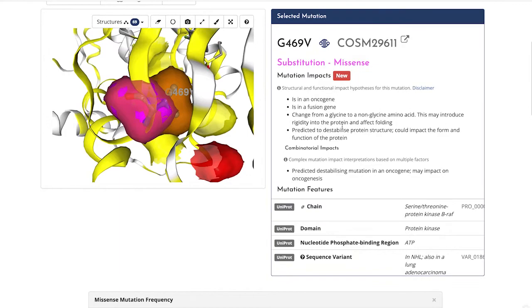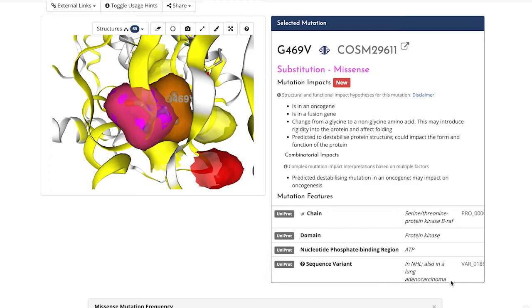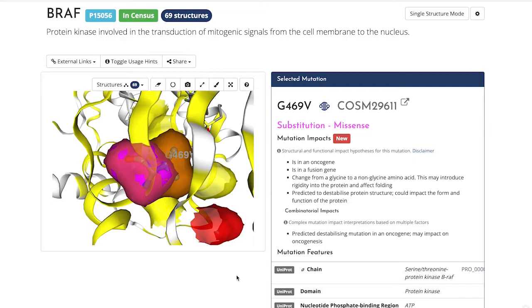For instance, a change from a small to a large amino acid and a gain of a negative charge. Our pipeline tells us that this change is predicted to destabilize the protein structure. Other useful information appears here as well. For example, G469V affects a protein kinase domain, a region where the ATP can bind. And we can see which kind of cancers this mutation is reported in.